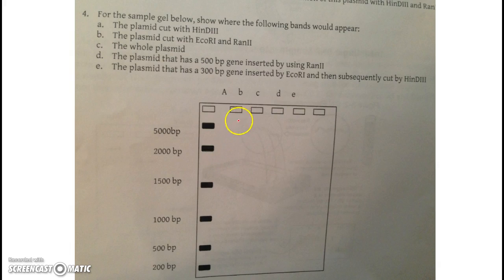So now what they want us to do is pretend that we're running this through a gel. So these are all the different lanes. And so it looks like our A, B, C, D, E is off a little bit. But let's take a look at A. So let's just say this is A, B, C, D, E. Okay. And so for A, we're cutting the plasmid with HindIII.